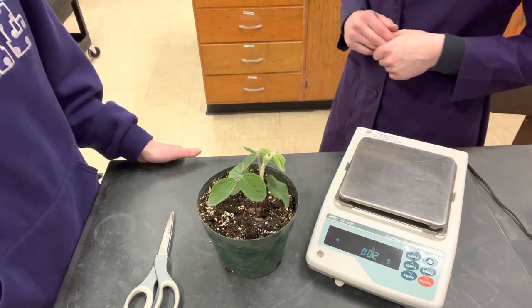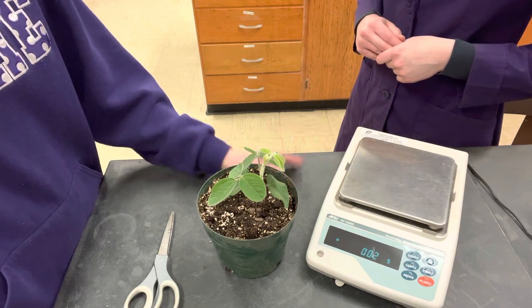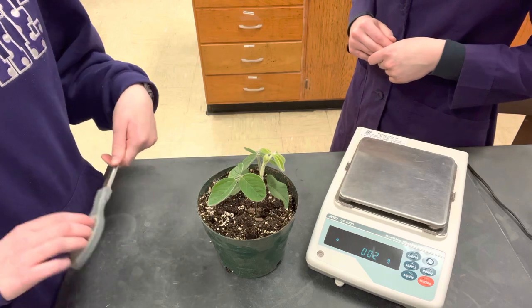To start out you're going to need your soybean, some form of a scale that can measure in grams, and something to cut with — scissors, shears, or any kind of hand clippers will do.